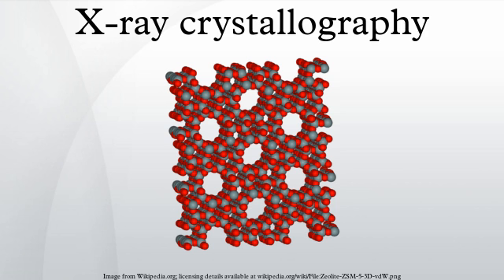Scattering. As described in the mathematical derivation below, the X-ray scattering is determined by the density of electrons within the crystal. Since the energy of an X-ray is much greater than that of a valence electron, the scattering may be modeled as Thomson scattering, the interaction of an electromagnetic ray with a free electron. This model is generally adopted to describe the polarization of the scattered radiation. The intensity of Thomson scattering for one particle with mass m and charge q is given by the following. Hence the atomic nuclei, which are much heavier than an electron, contribute negligibly to the scattered X-rays.